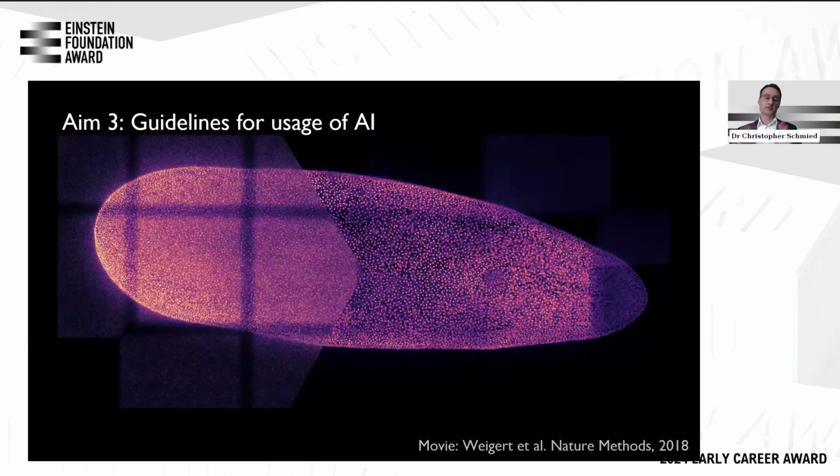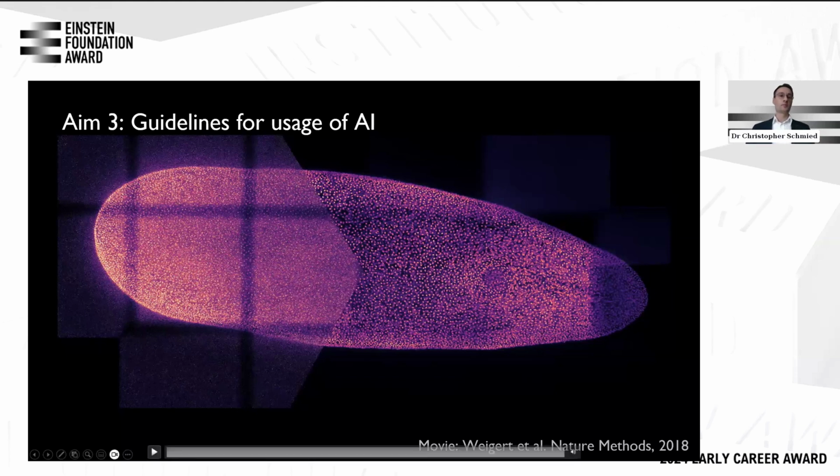Finally, the last years have shown us the great potential of artificial intelligence to accelerate the scientific process. I show you this on one example of impact of a machine learning method. Here, I show you a flatworm imaged with microscopy. Living organisms pose a specific challenge for microscopy, as we have to image them with low light, otherwise we kill the animal in the process.